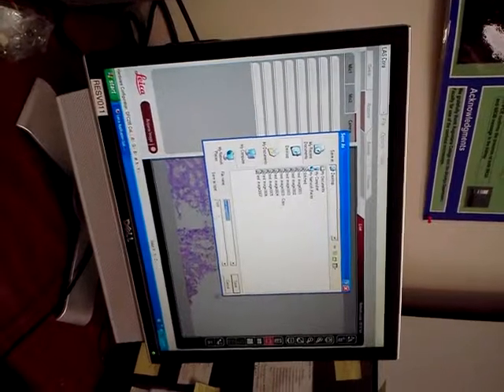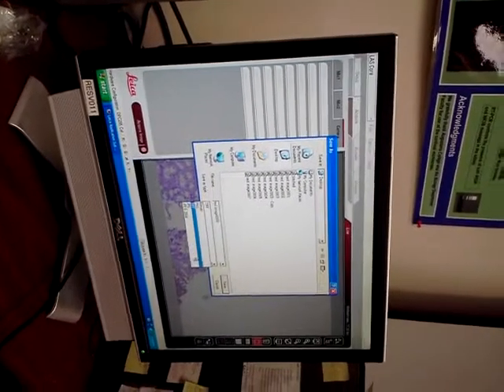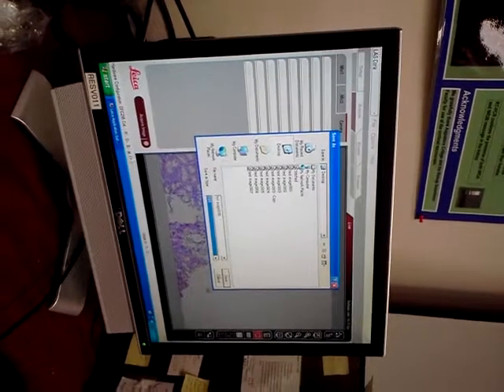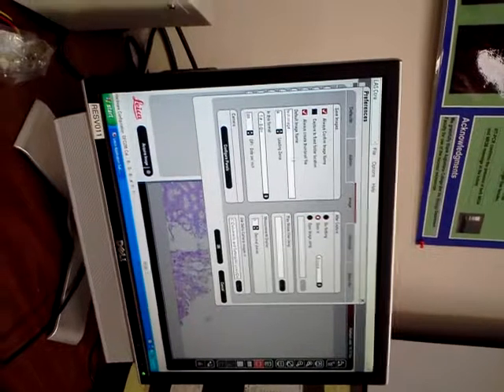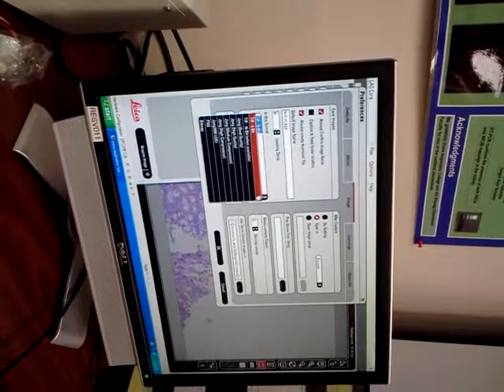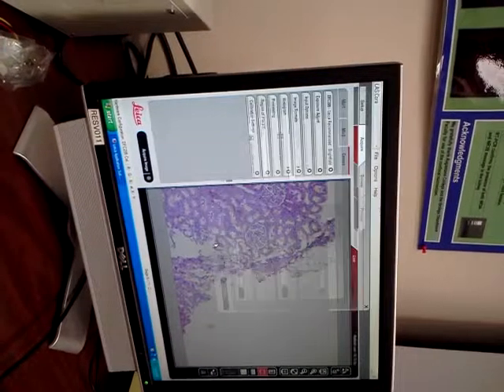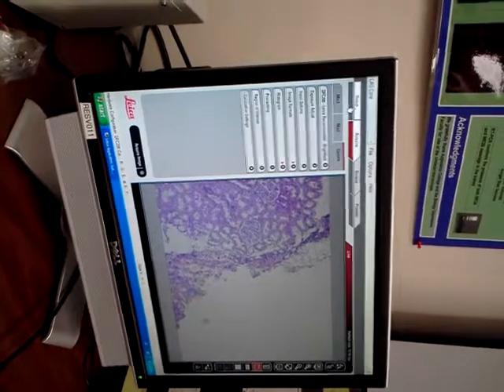So right now is where you would tell it what you wanted to save it as. Just JPEG or TIFF is all it is on here. I always save everything as a TIFF and then change it later. Yep, that's what you'd recommend. Do you have 16-bit TIFF? Yeah, we do, when available. When would it not be available? I don't know, probably depending on the computer, maybe.